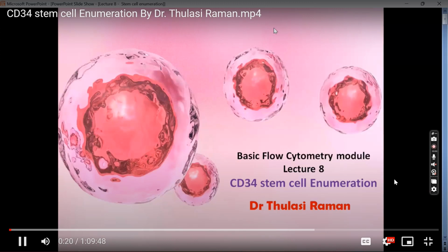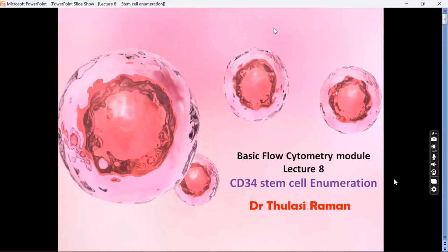Most needed sensitive flow cytometry assay that you do in your laboratory. So when you're doing this assay, you have to be very careful with all the reagents you're using, the technical things you're doing, and the expertise of your technician matters much, because the value you're going to give has a bigger impact on patient care.